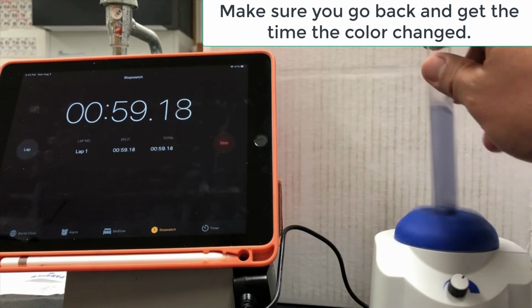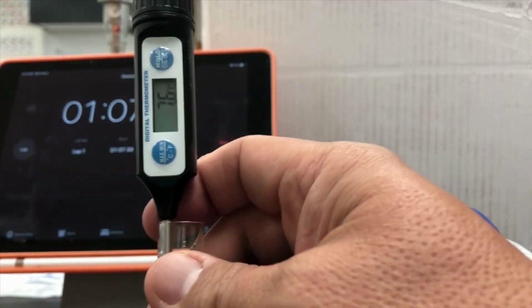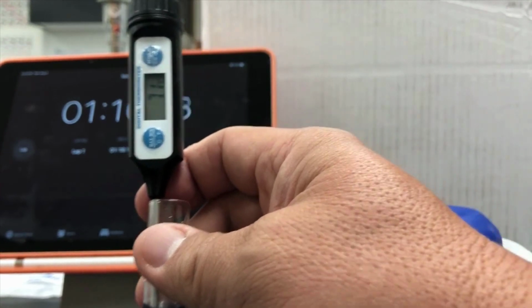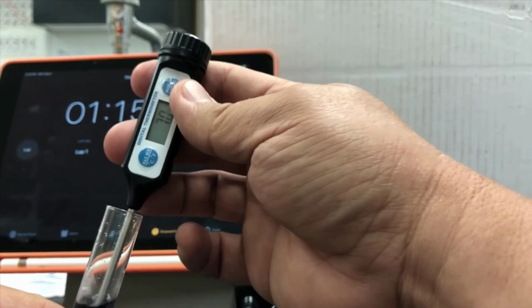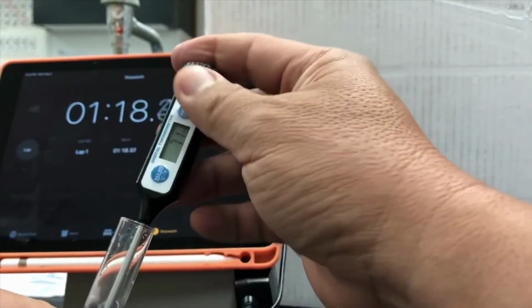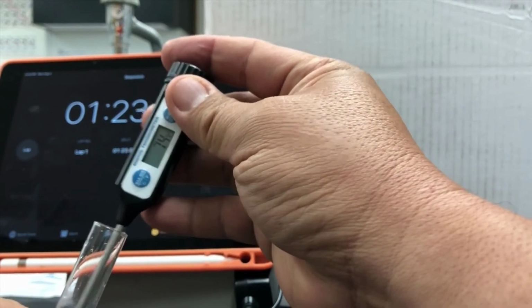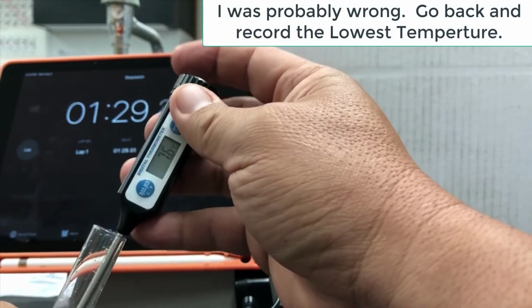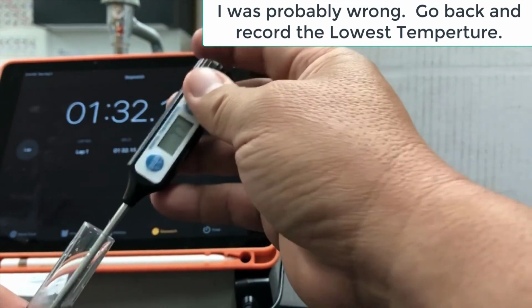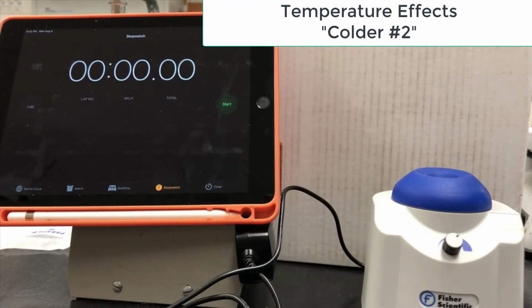Looks like that did it. So we'll drop the thermometer. You'll have to go back and see at what time that took place. We'll drop the thermometer in and see where that ends up at. So it's actually warmed up considerably. We're right around 7.4, 7.5 degrees Celsius at the lowest, okay? So this will be our second temperature data point.